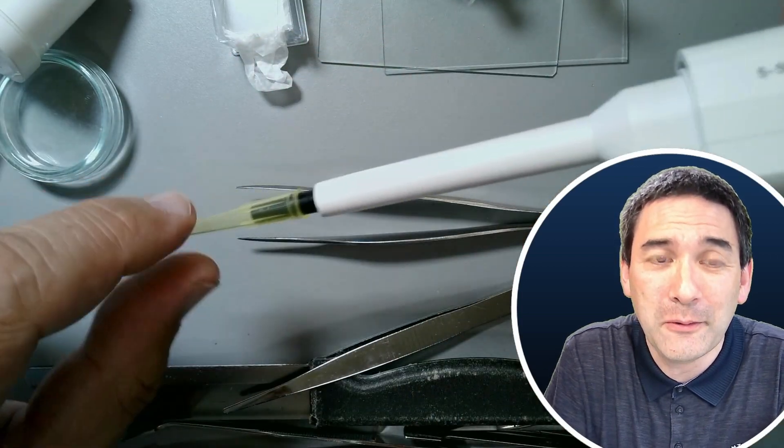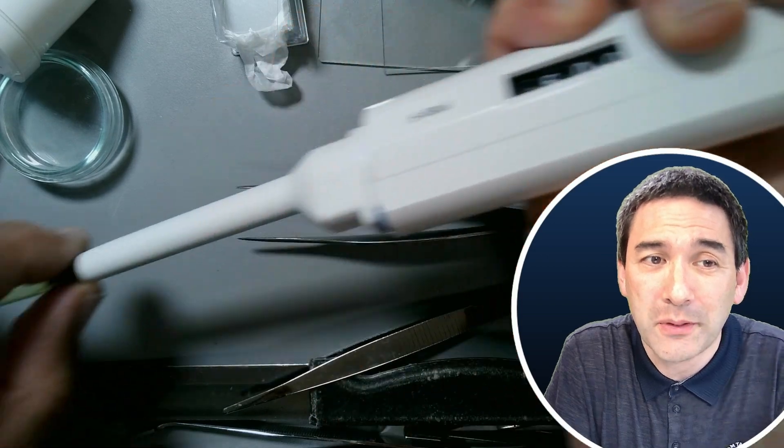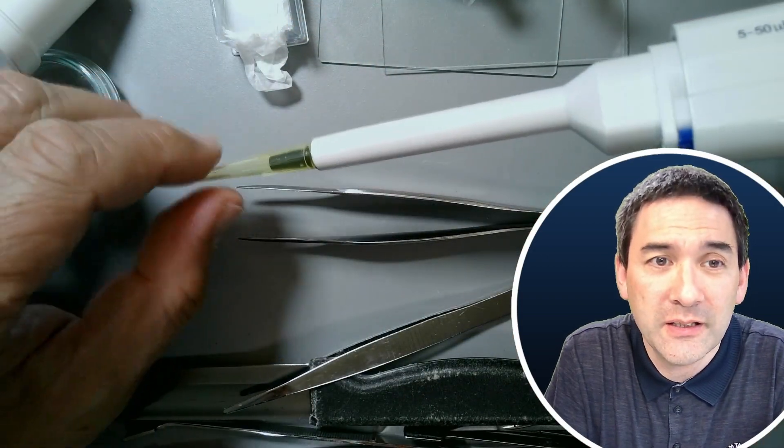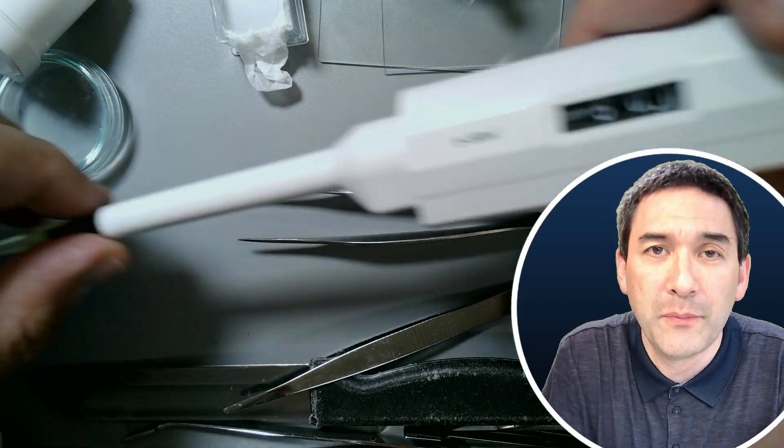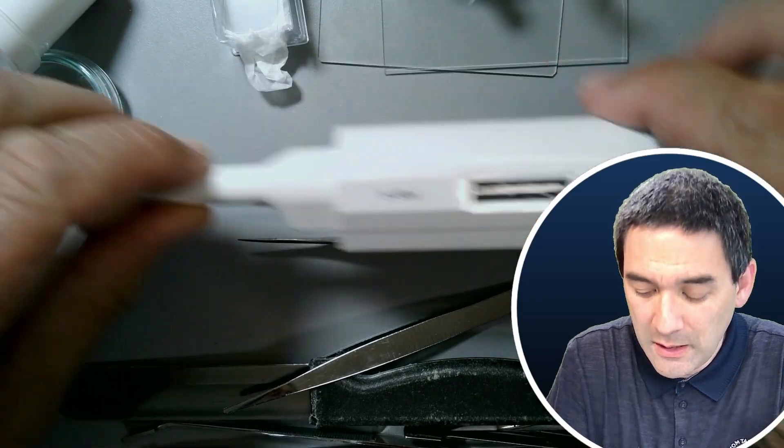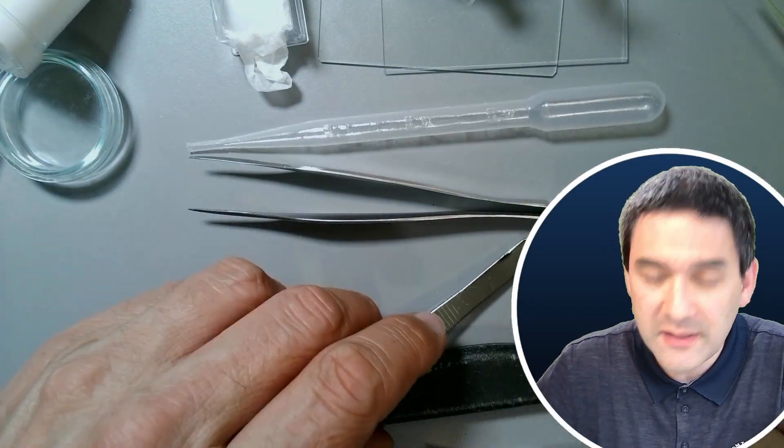The tip here can be exchanged by simply pressing this button and then it flies off. You can always get a new tip if you work with a new sample.